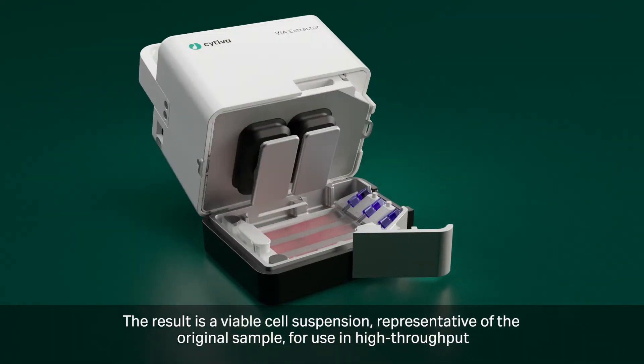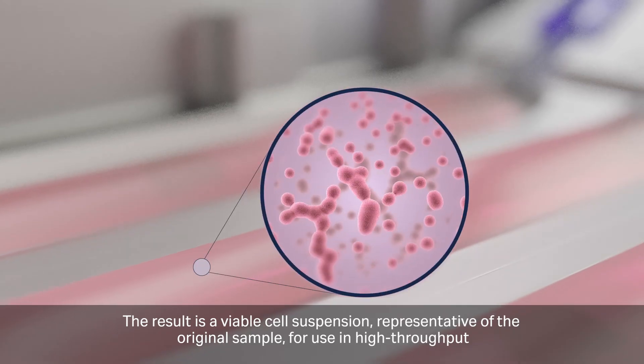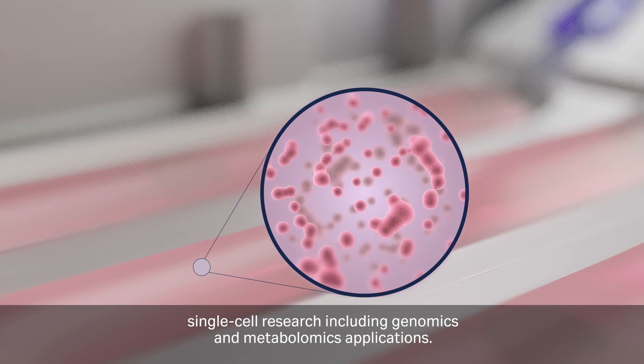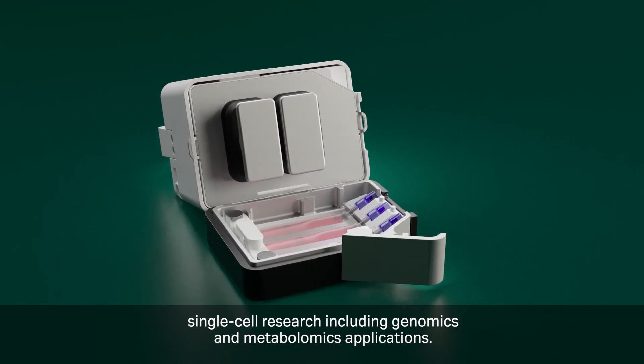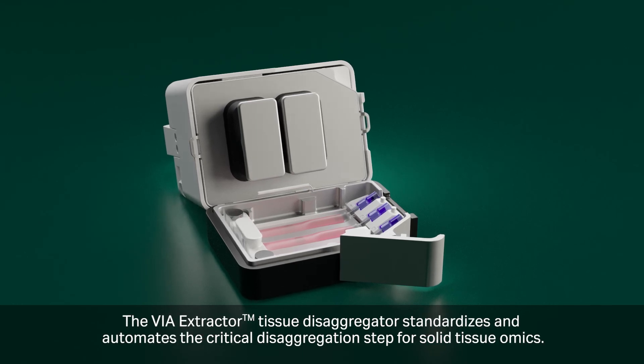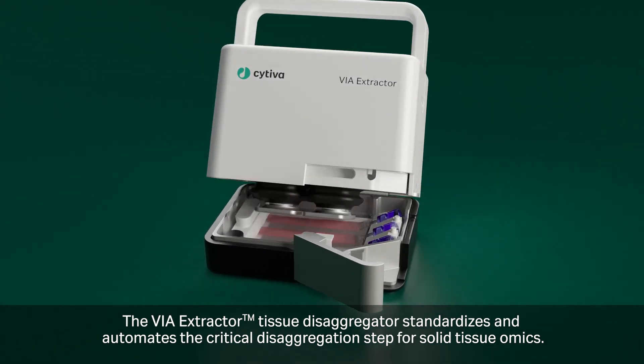The result is a viable cell suspension representative of the original sample, for use in high-throughput single cell research, including genomics and metabolomics applications. The VIA Extractor standardizes and automates the critical disaggregation step for solid tissue samples.